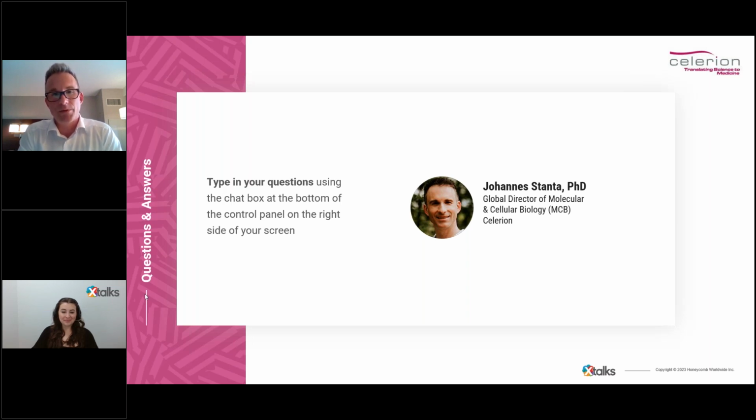The answer is no. There is no minimum volume. It has to be balanced, in terms of also it will have a direct impact on your limit of detection, of course. I would say a standard collection for most of these matrices is not too difficult to get. Obviously, urine, you've got loads. Blood collection as well, I think the minimum we'd say is 150 microliters, which again is usually very easily obtained. Saliva, usually not too difficult, easy as well. And also with feces, we don't need loads. Really, a small quantity will allow us to do the extraction. Most extraction kits that we use are somewhere in the region between 100 and 500 either milligrams or microliters that you can do.